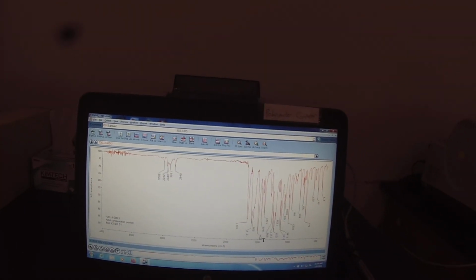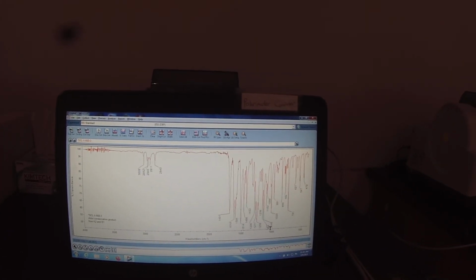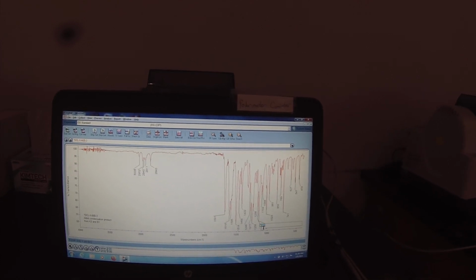So that looks pretty good. That peak might be a little off scale. Might not print right. Move that up. Same with that 1163 peak. That one's a little shady. There we go. So let's print this. I'm going to save it first.